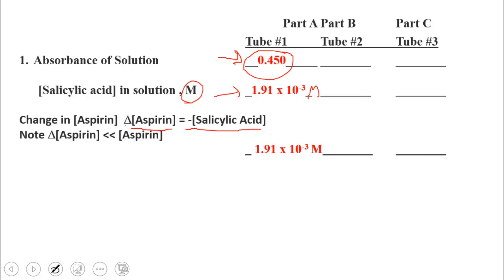Okay? You can weigh out the sample, add 10 mLs of water, put it into the water bath, and of course record the temperature every 1 minute interval until you record the absorbance. Once you've recorded the absorbance of test tube number 2, again, we can put the contents in waste and move on to test tube number 3. In test tube number 3, though, you will need to reduce your water bath to a temperature of 70 degrees, and we'll talk a little bit more about that, but we will change the water temperature.